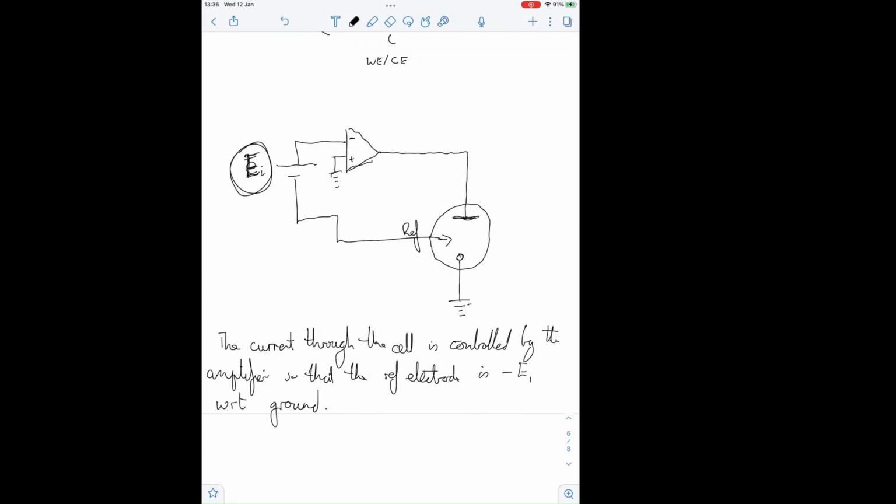Vacuum pumps are horrible with your ground circuit. If you have a vacuum pump on the same loop as your potentiostat, you'll get leakage through to your ground circuit and things will not work nicely.